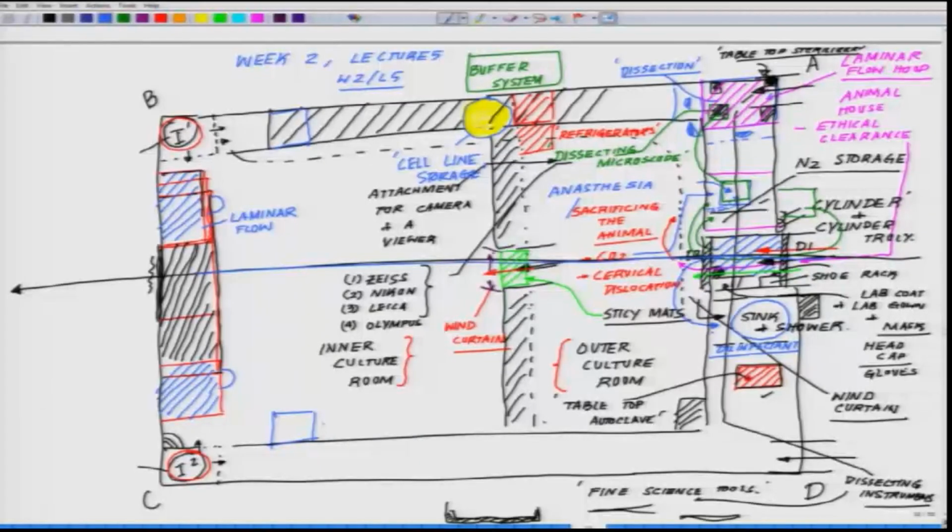I cannot tell that, but I can recommend what all you have to avoid. You have to place a microscope, and this is a microscope which will probably be a compound microscope. Now, whether you want to have a fluorescent attachment with it or not. So, you have a compound microscope plus, because these are all addendum.